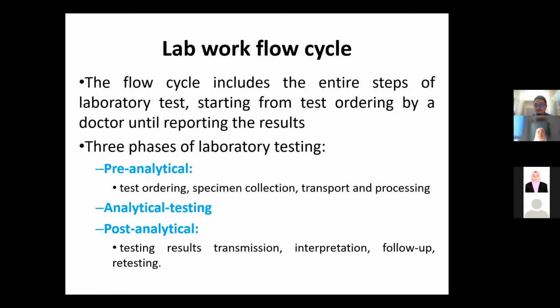There are SOPs on how to order a particular lab test, how to collect specimens, and then also how to transport and process them before they reach the lab. And then we have the analytical testing. Yeah, this is really in a lab setting. Most of the SOPs concern the use of the machines, how the lab is managed, etc. We'll see some of it later on.